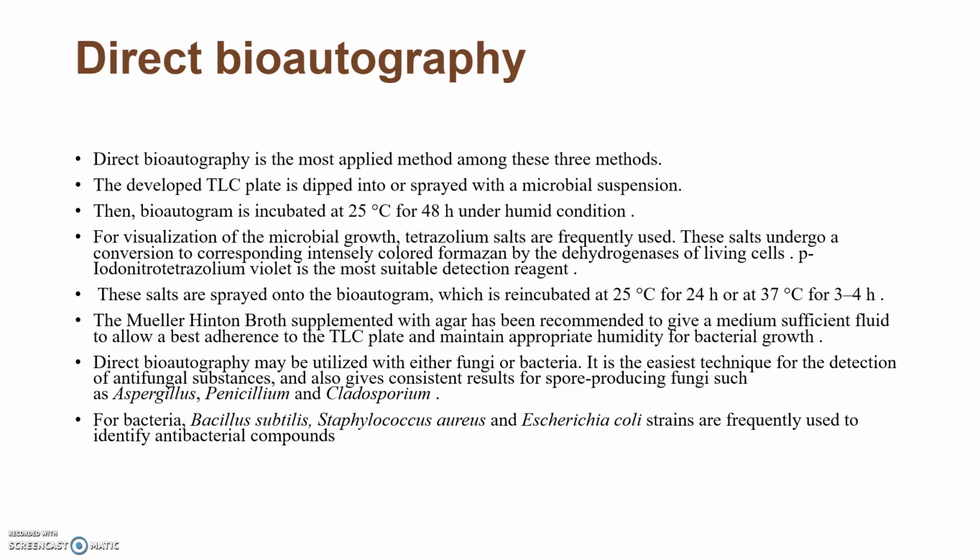After spraying, it is incubated again at 25 degrees Celsius for 24 hours or 37 degrees Celsius for 3 to 4 hours. Then Muller-Hinton broth supplemented with agar has been recommended to give a medium with sufficient fluid to allow best adherence to the TLC plate.